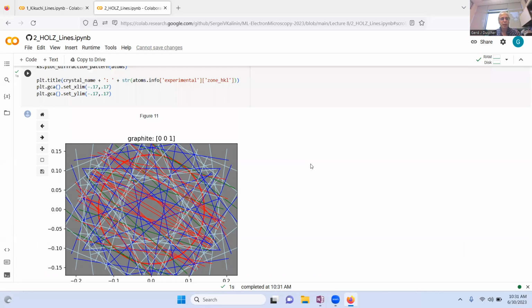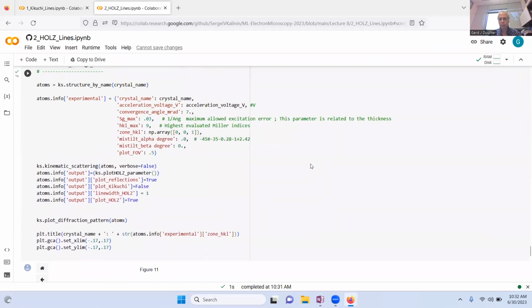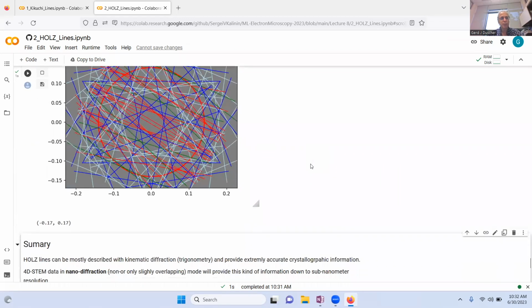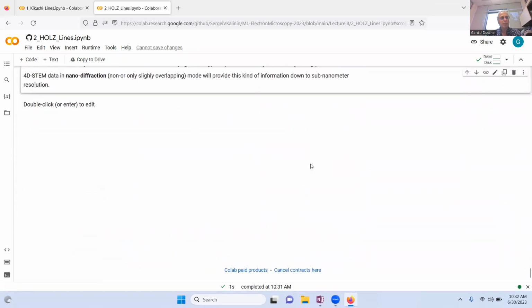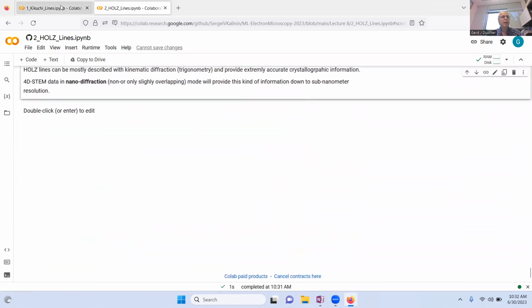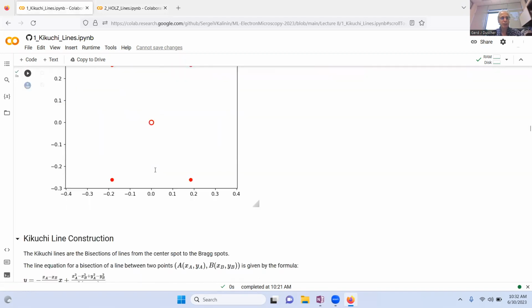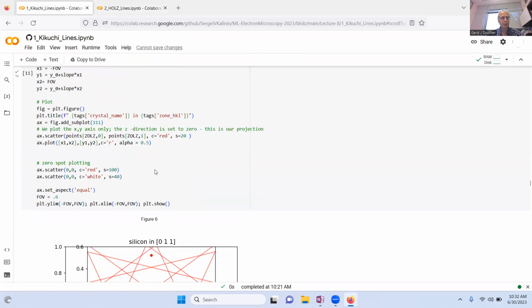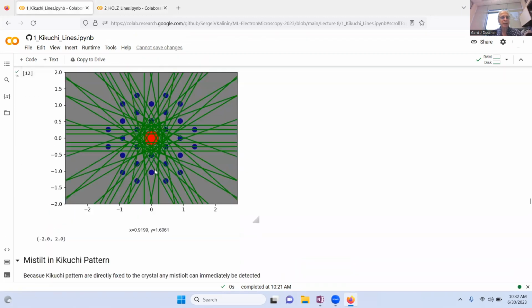So you have to be careful. Also, there are small deviations, obviously, at high voltages. It's not completely trivial to measure them. So let's go back to the Kikuchi lines, because on the bottom here, now that we know how powerful that is, we can look at that.